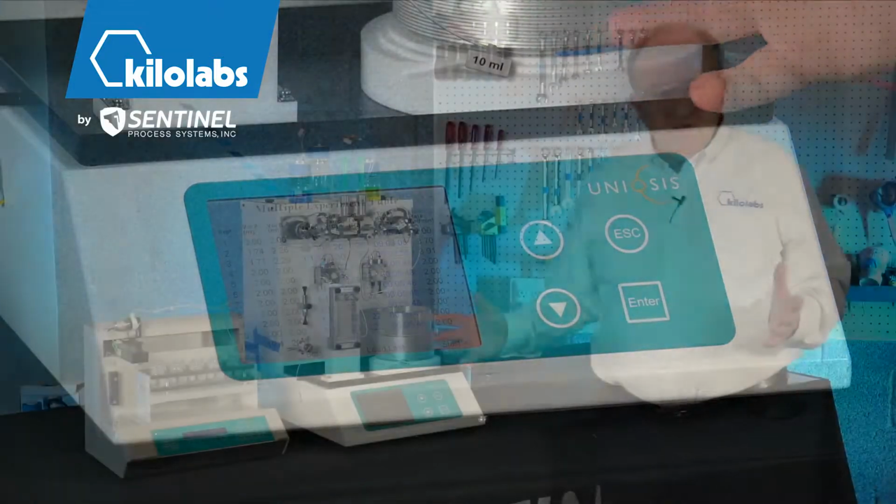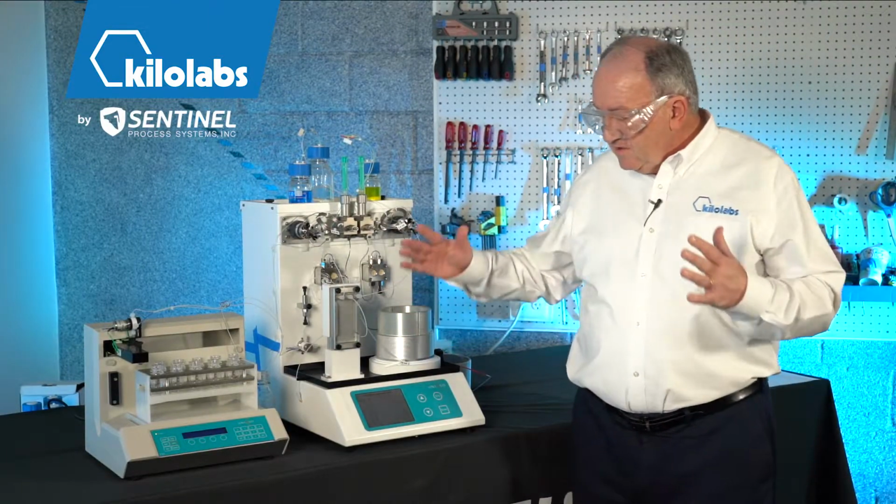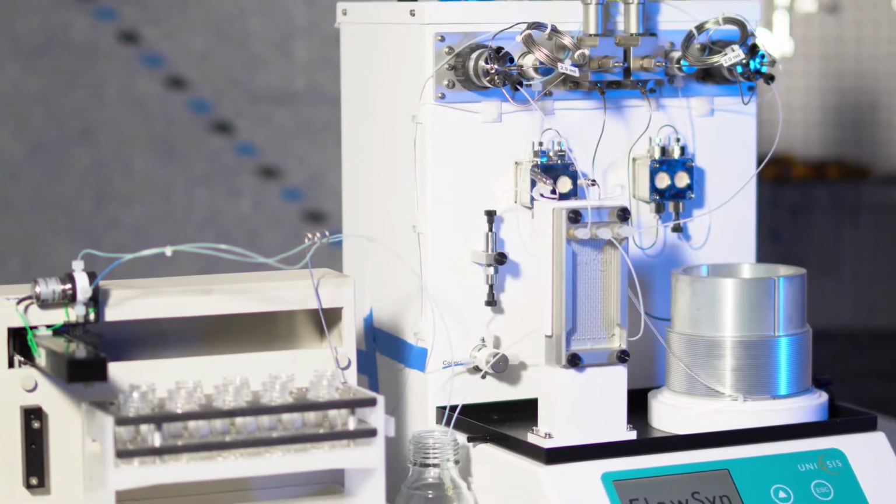So as you can see, what the table does is the table provides you with a methodology for changing 3 experiments, and we can go through the rest of the table and line it up to be 10 experiments, and all 10 experiments are going to be collected in the fraction collector.